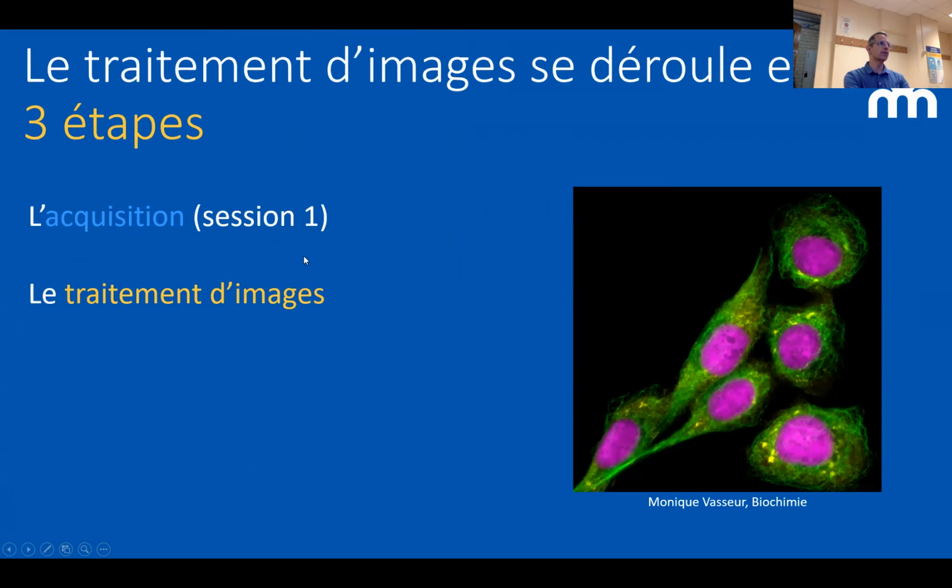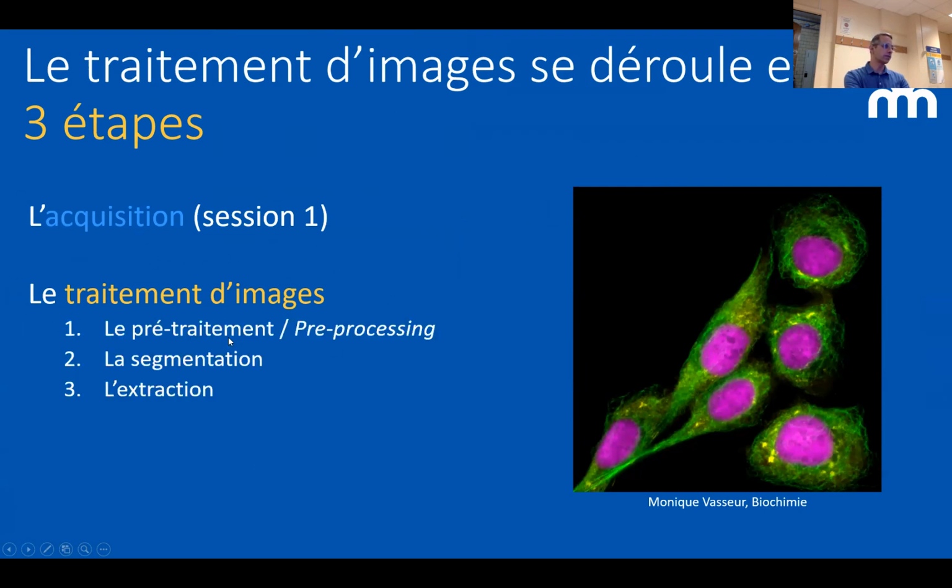The acquisition, we discussed it in the first session. So this session is going to be image processing. And the 3 steps we're going to look at: the first one is the pre-processing, the second one is the segmentation, and the last one is the extraction.